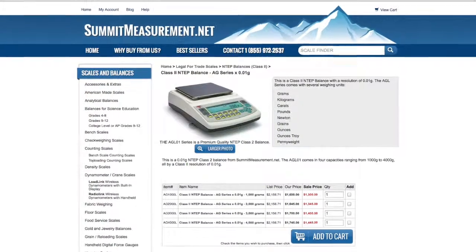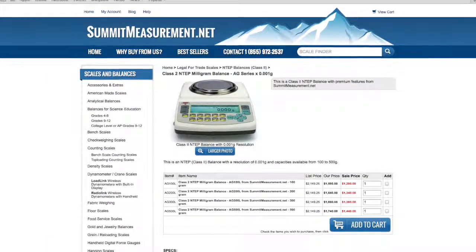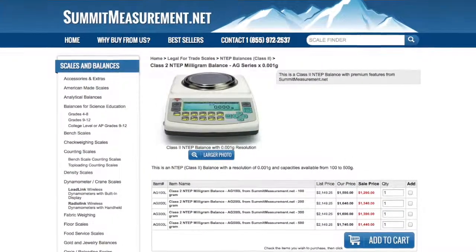The AGL 0.01 balance comes in capacities ranging from 1,000 grams to 4,000 grams, and the milligram version can be purchased in 100, 200, 300, or 500 gram capacities.